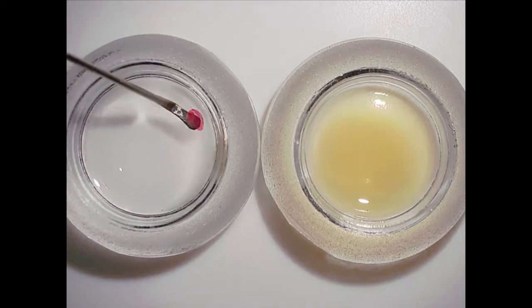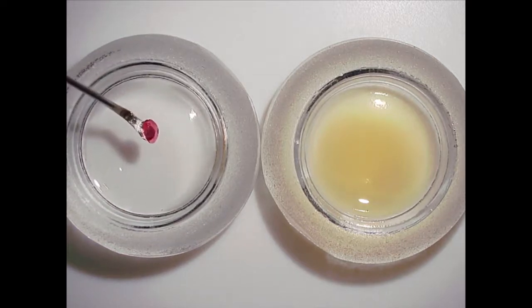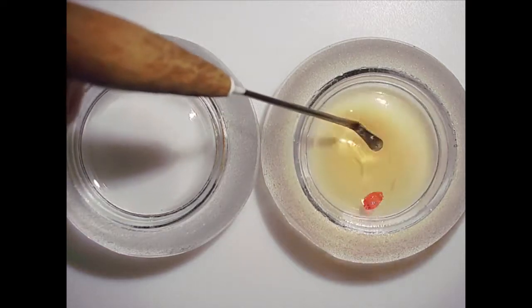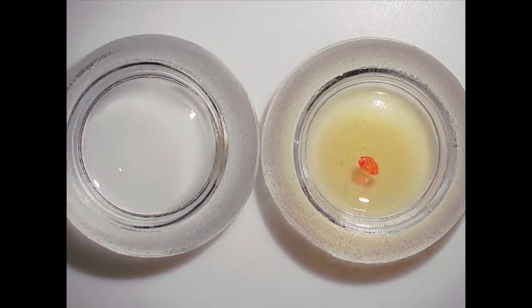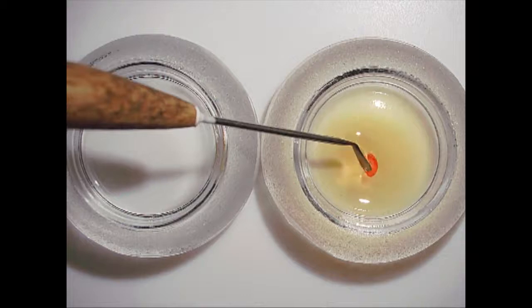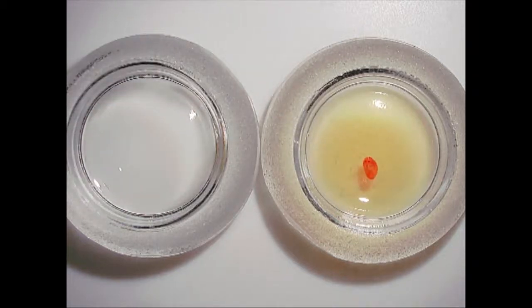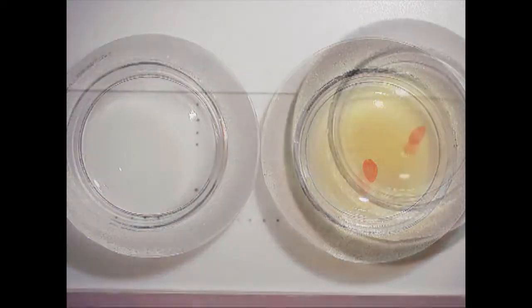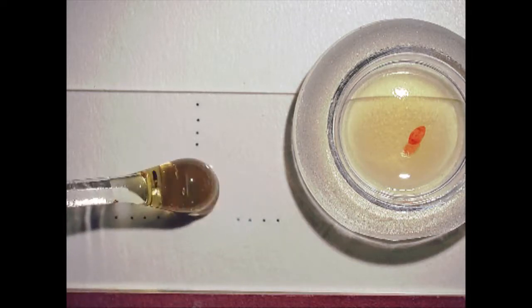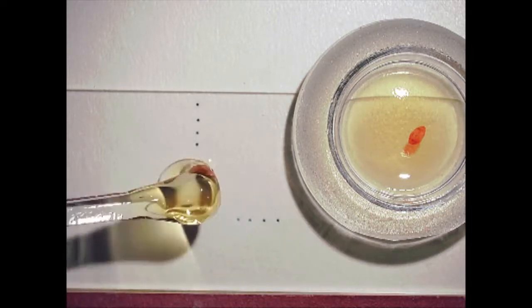Under the specimen. Sometimes you have to just sort of get under it and lift it up. Just touching the surface, you'll see the difference between the alcohol and the clove oil. The specimen will skate over the surface. And then moving it down, submerging it in the clove oil. Our next step takes us from clove oil to the final step, which is the balsam or the permanent mount.